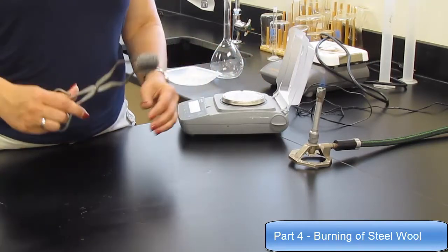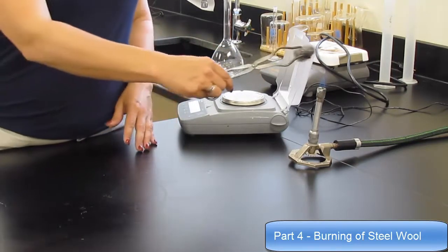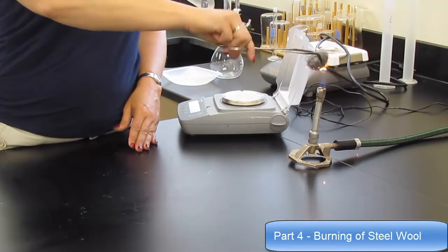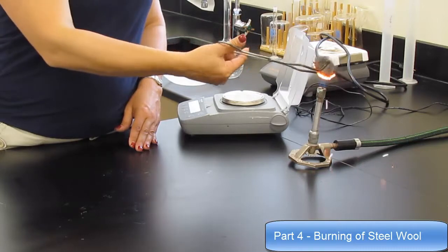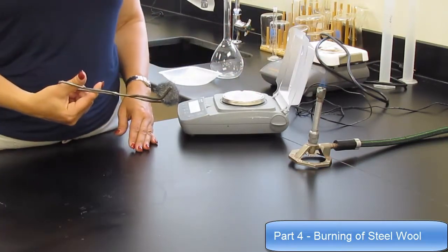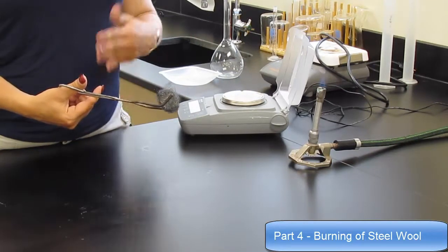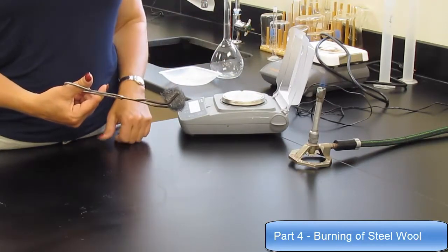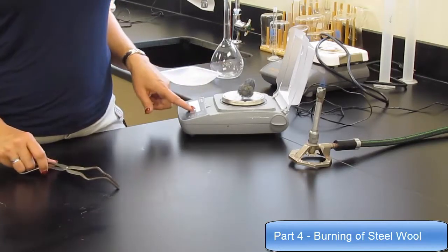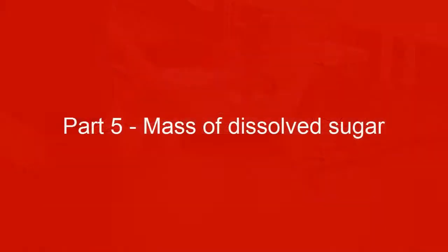Take the mass of that steel wool, and now you're going to take that and hold it in the flame. Once you've burned it for a little while, take it off and allow it to cool a little bit. Make sure you take some observations before and after, and take a mass again.